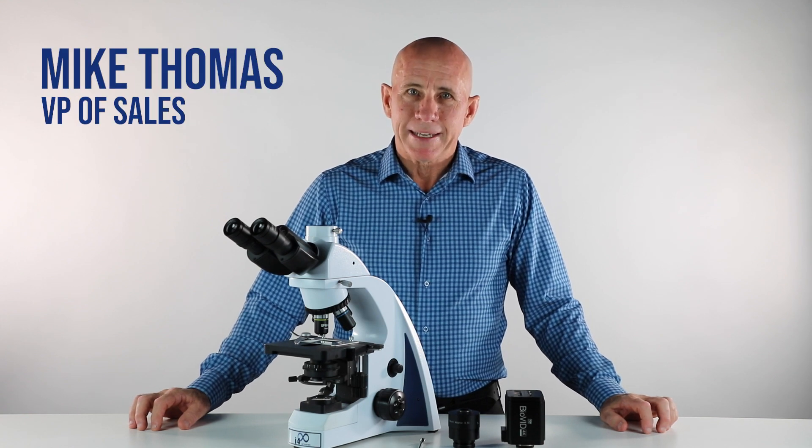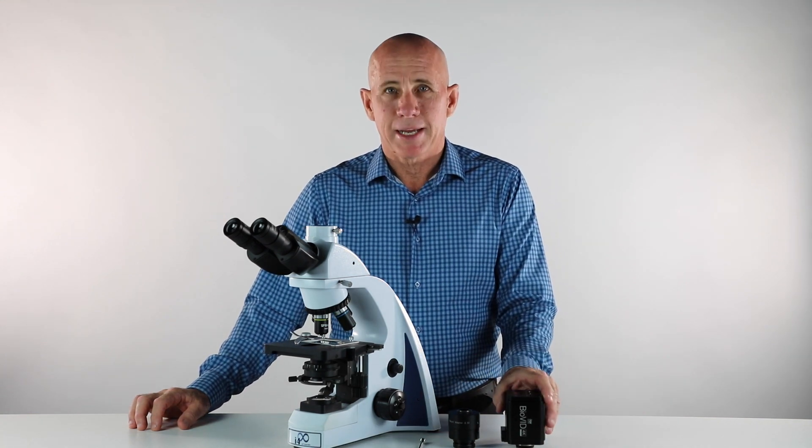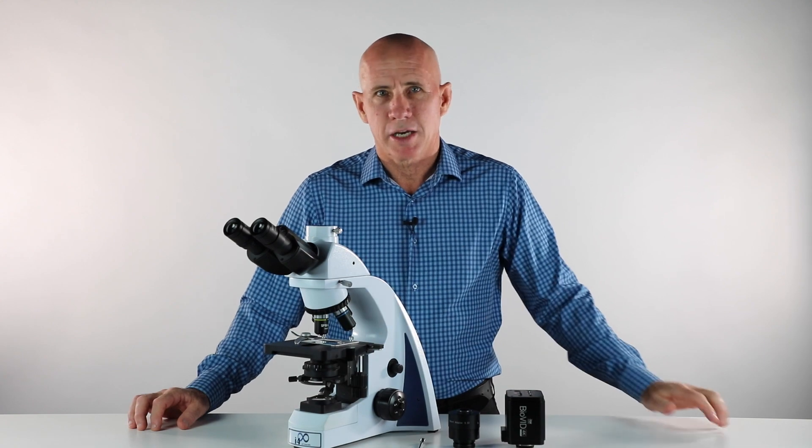Hello, I'm Mike Thomas with LW Scientific. This video will cover mounting cameras onto the I4 trinocular microscope.